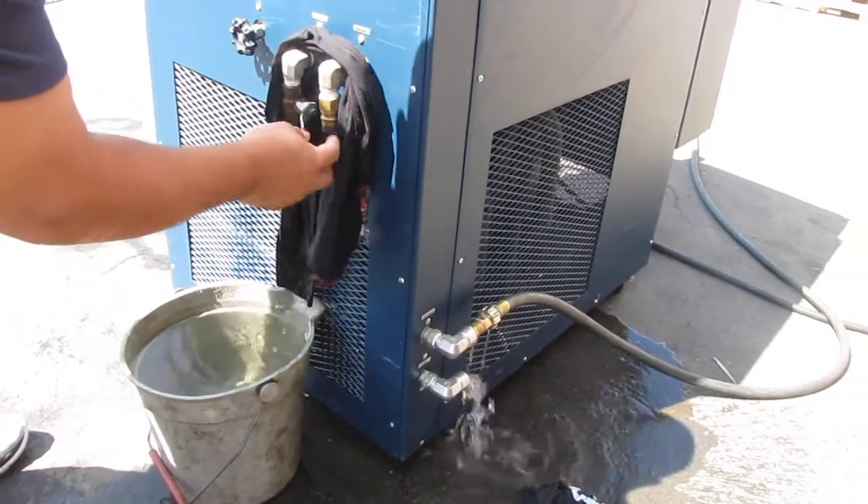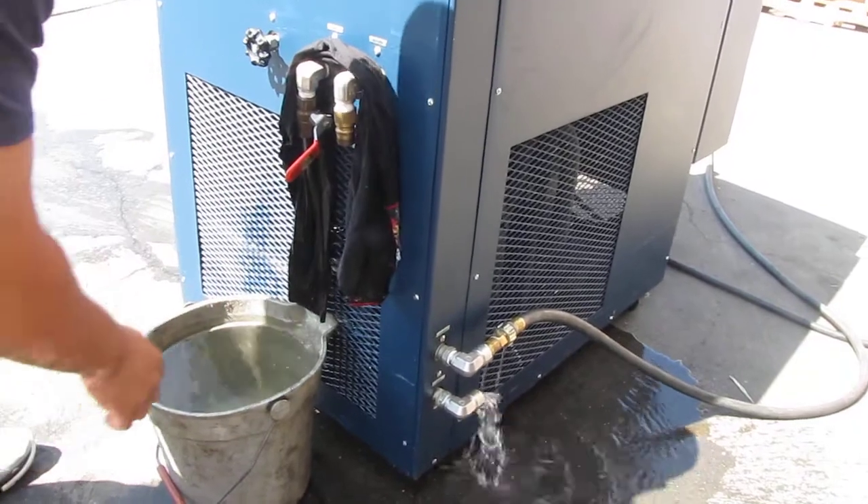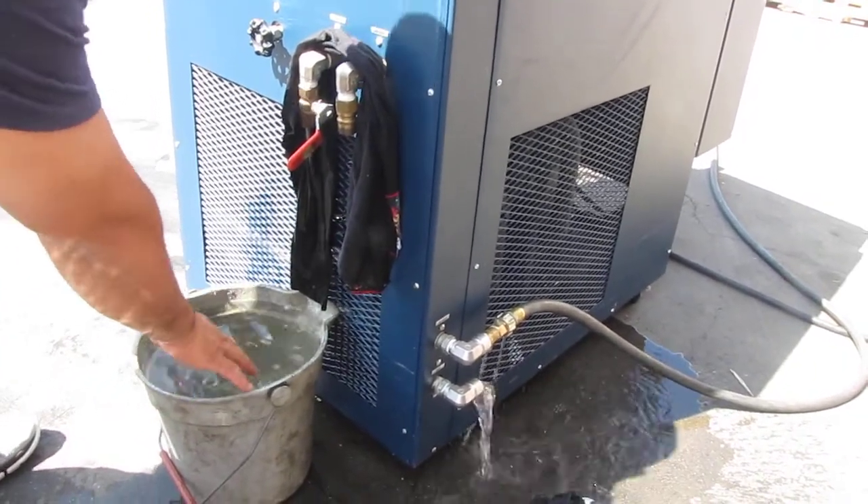Usually you have these quick connect fittings and you have lines, but right now we're just simulating this cold water. It's very cold right here.